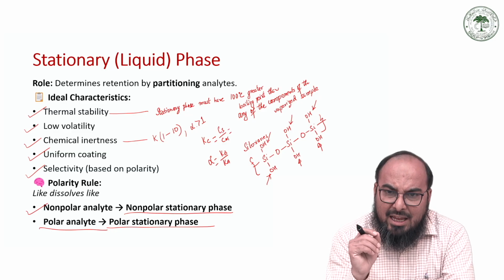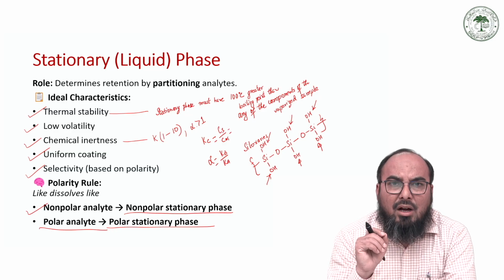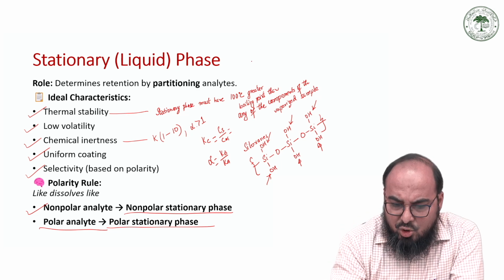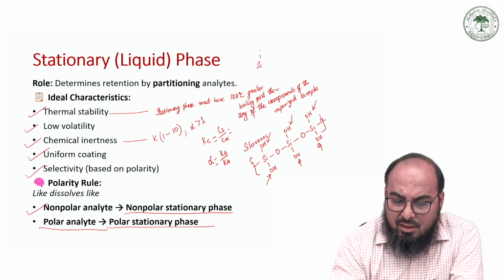But at the same time, if you replace these hydroxy groups with methyl groups, then what you get? You will get a stationary phase like this.